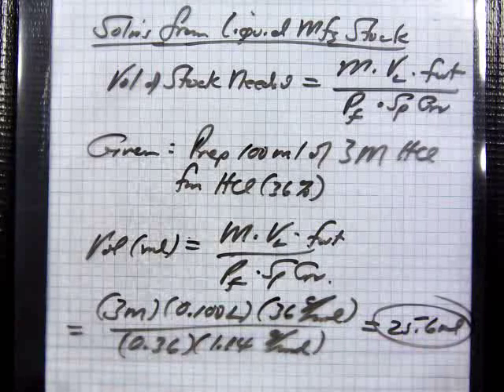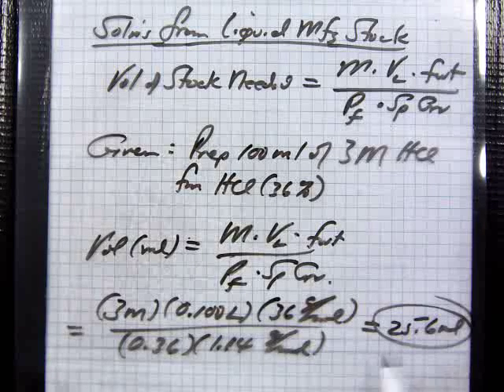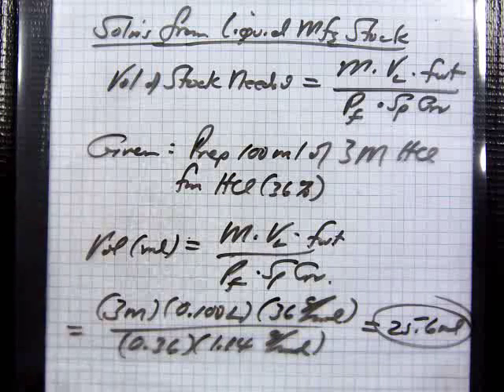You need 3 molar. So if you tried to pour water on top of that, it would be very dangerous, bottom line. So what do you do? Well, if you're trying to make 100 mils, that's going to eat up about a quarter of it real quick. So you probably want to take about 25 or 30 mils and then add that on top, because you don't want to take half of it or 75 mils and try to pour that in. You'll exceed the total volume you have. So you want to be careful. That's why I built this problem like that.